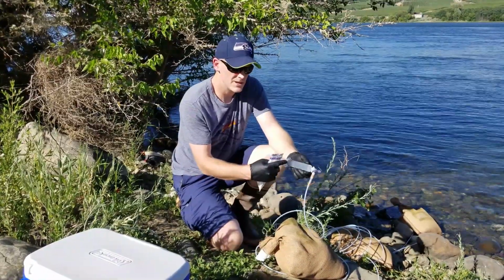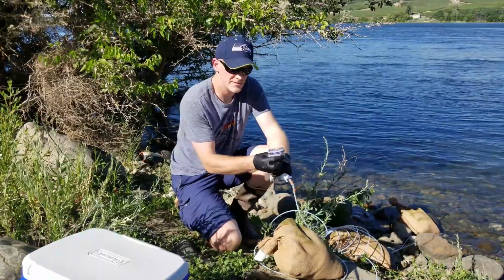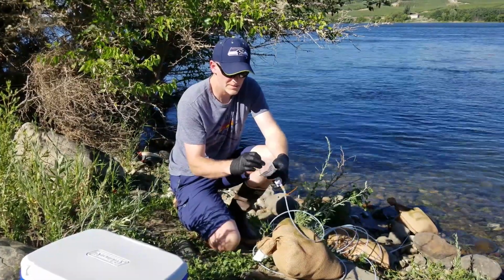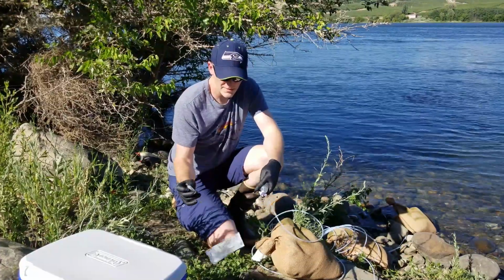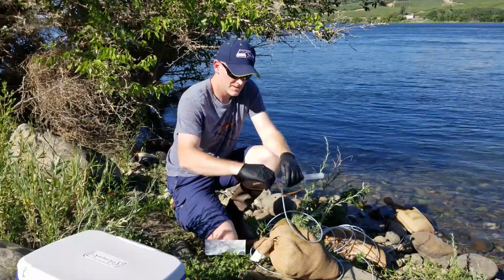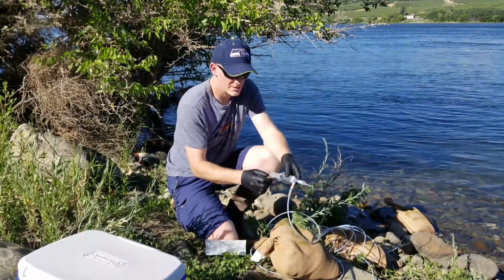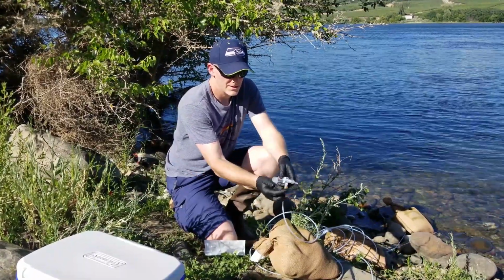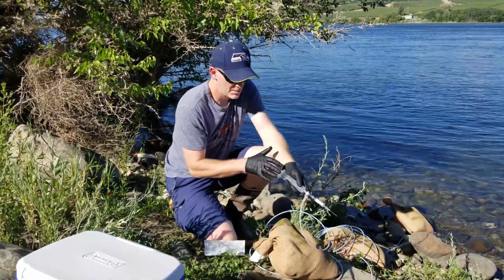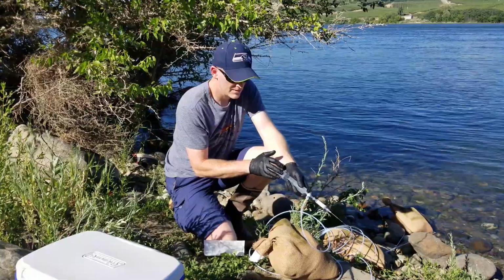After you've got your volume full of sample water, after flushing 3 times, you're going to locate the filter that has the needle attached to it. You're going to pull that out, careful not to touch the inlet of the filter. Screw that onto the luer lock of the 3-way valve. Release the protective sleeve over the needle and just let that drop. Now push a few mils through the filter housing.